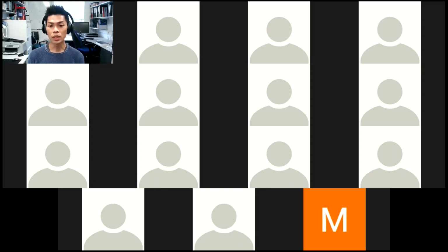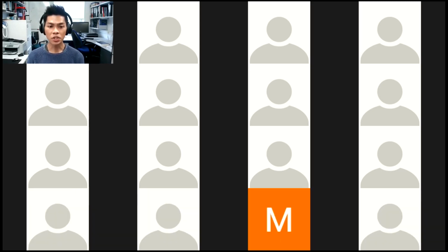You don't want to use software or tools with different versioning and different outputs, because then the comparison of your data would be very different. There are several ways to manage version control, and I hope in the future I can talk about this if there's enough interest. It's actually a very interesting topic.